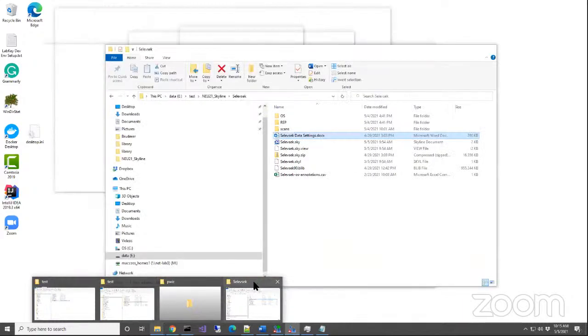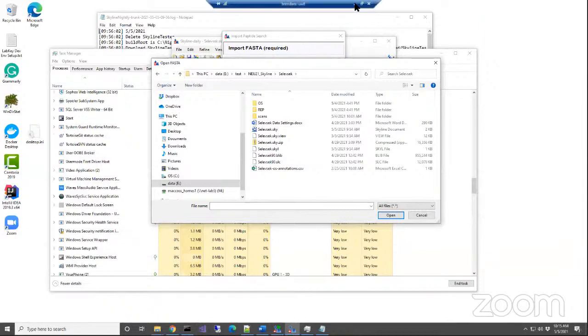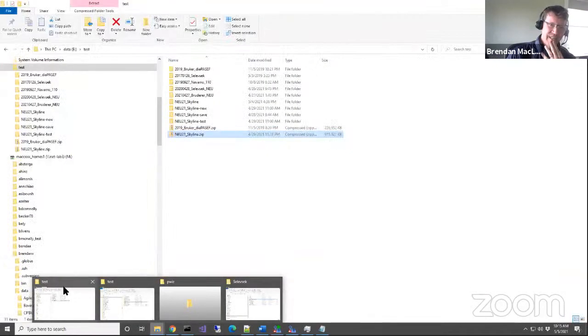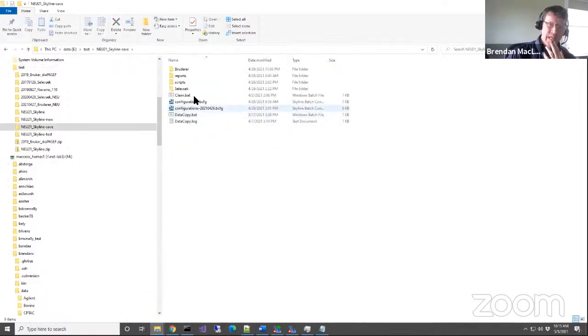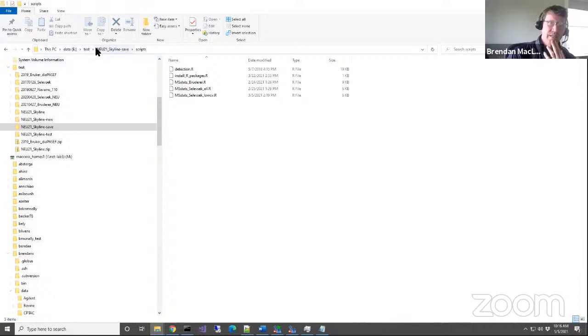Okay. Hang on. Or you can add files, but I think they have to be in a Dropbox of some sort. Okay, I'll find it. Wow, that's really disappointing.